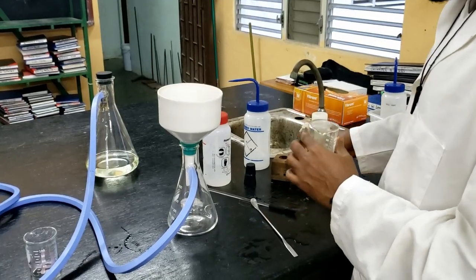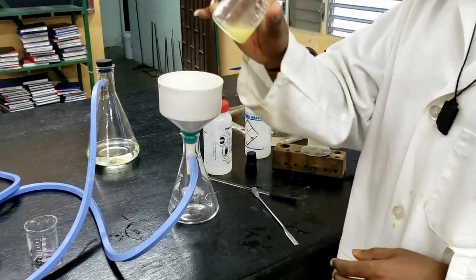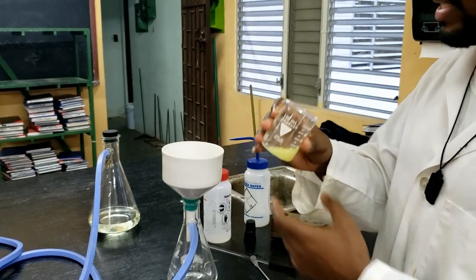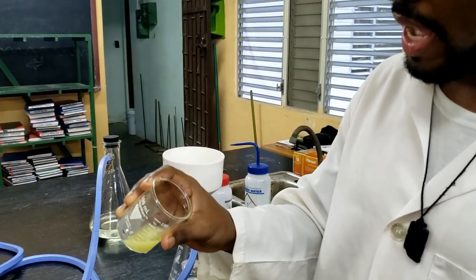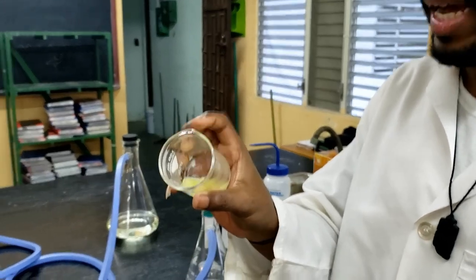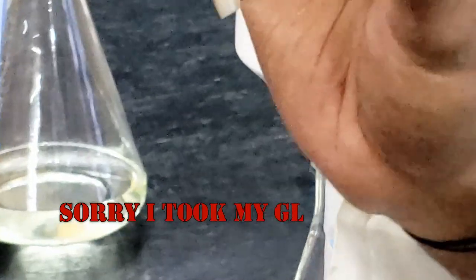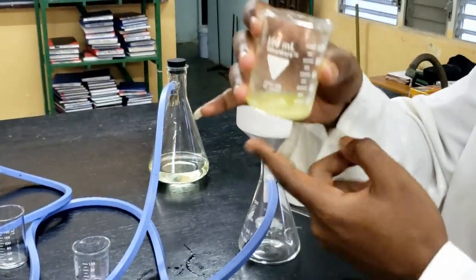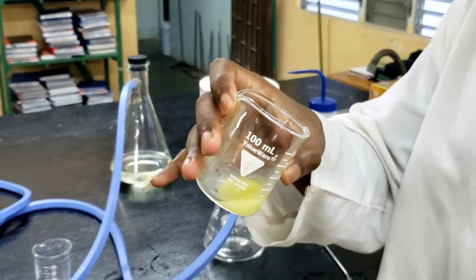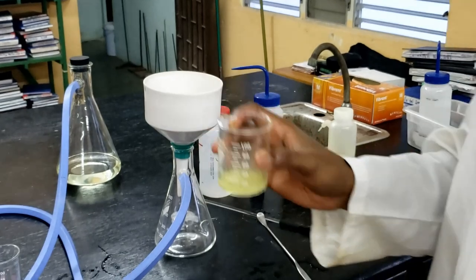We allowed the mother liquor to cool to room temperature after evaporating it to 10 mLs, and then we cooled it in the ice bath once more. So here we have a second crop of the p-bromonitrobenzene, some more crystals. So we're now going to repeat the vacuum filtration and the washing so that we can again separate the liquid, which will contain the ortho, and the solid, which is the p-bromonitrobenzene.